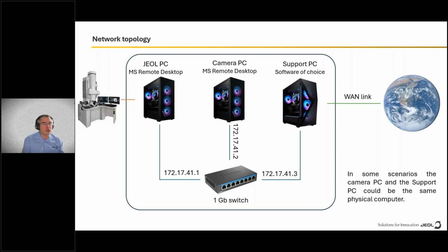However, if your machine is a higher end microscope like the JEOL F200 or 2200 or a cryo-arm, neo-arm or grand arm, you are highly likely to have one more PC available in your facility, and this is the camera PC. This is the computer that controls the camera.